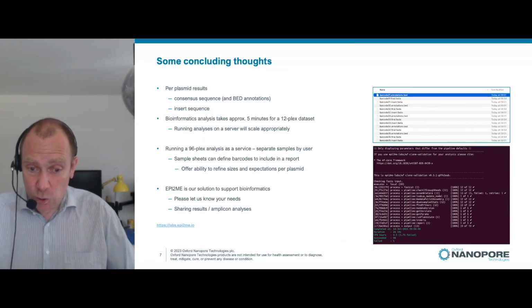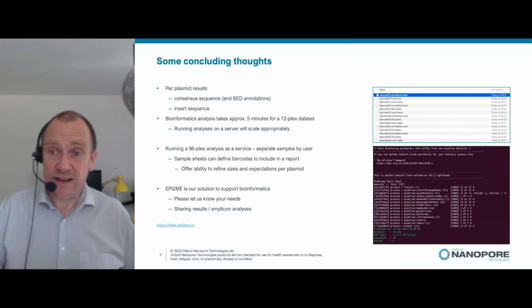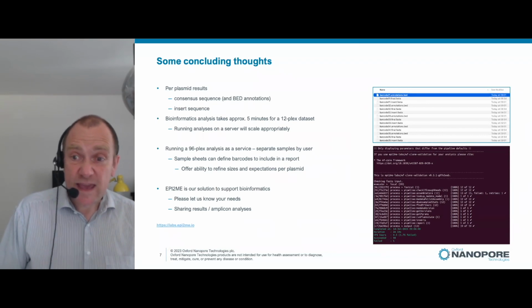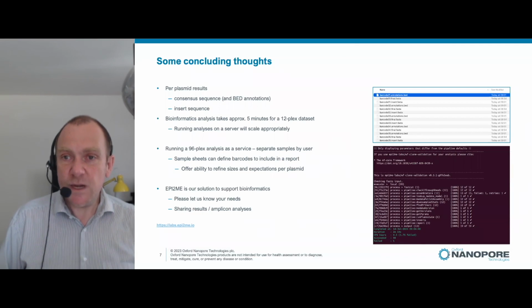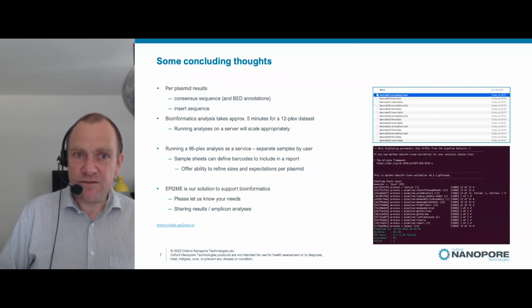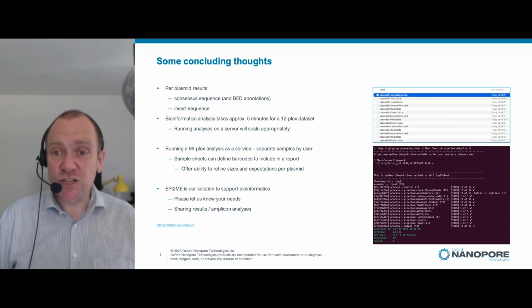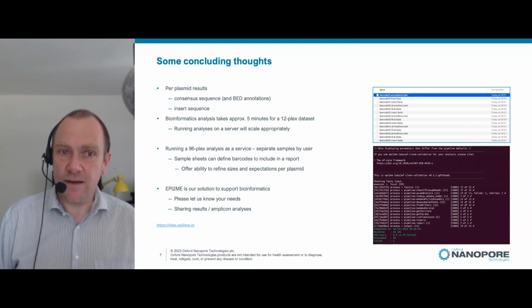It is a single workflow that really automatically just takes a collection of FASTQ sequence data and helps you towards the results. The results aren't just within the HTML format file. We also generate a folder of output. The output includes the complete plasmid sequence, but it also contains the insert sequence. We also present a bed file that describes the location of each of the genes and features observed within the plasmid. So hey, this is a great starting place. This is actionable information that can be used to question, is your plasmid exactly as you expected?